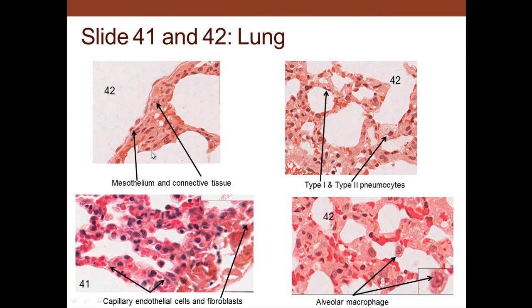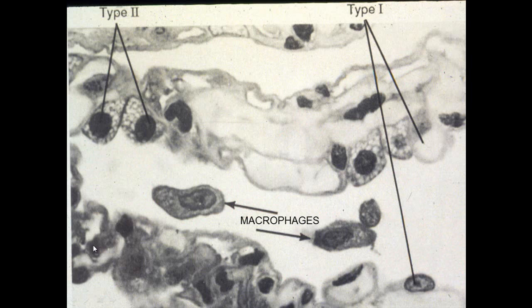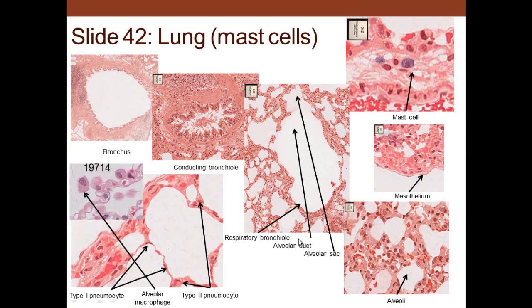If you look at the outside of a lung, you see the mesothelium. So this is actually the visceral layer of the mesothelium, and this would be the pleural cavity right in through there, but the lungs have been pulled out of it. Connective tissue, type 1 pneumocyte there, type 2 with this flocculent stuff, we can see it in through here and here and here. And then we have macrophages in through there, fibroblasts, and this is mesothelium again in through here, endothelial cells lining these red blood cells in the wall of these. And here we can see the type 1 pneumocytes here, here, here. A type 2 pneumocyte with a surfactant usually kind of in the corner, but you can see the surfactant located in there, and then we have macrophages there.